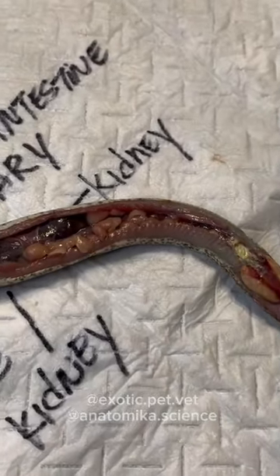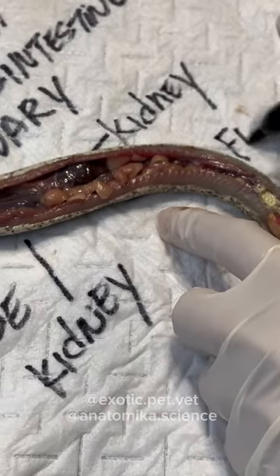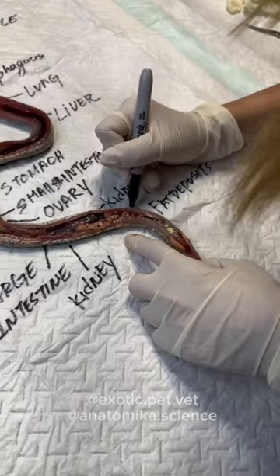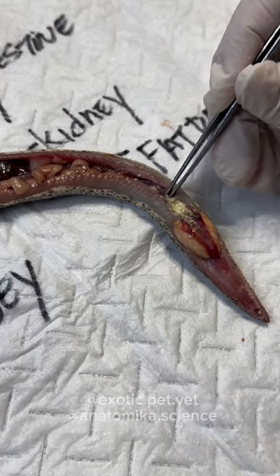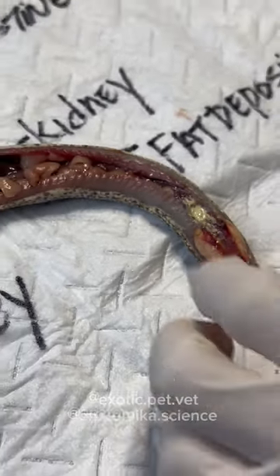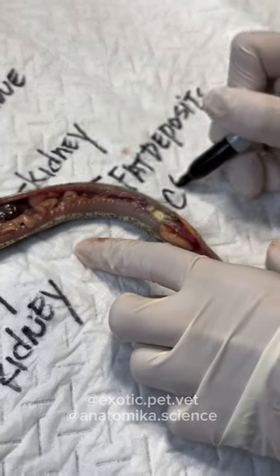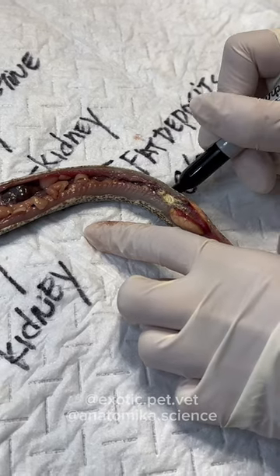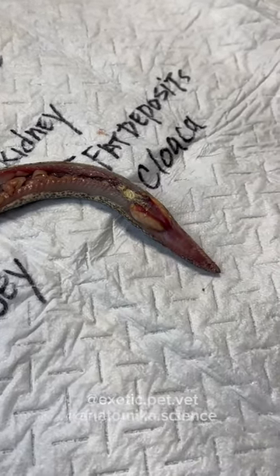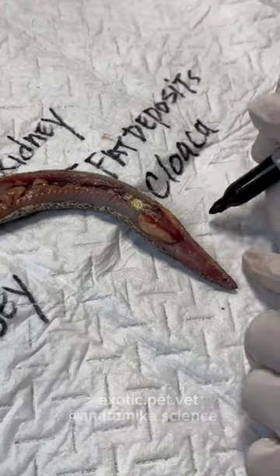And then some more fatty deposits that we saw earlier. The cloaca here has a lot of urates in it. You can't really see it well because we took the skin off, but that's where the vent would be. And then after that, you have the scent glands — which I've never seen before because I usually don't dissect that part, but they're really cool.